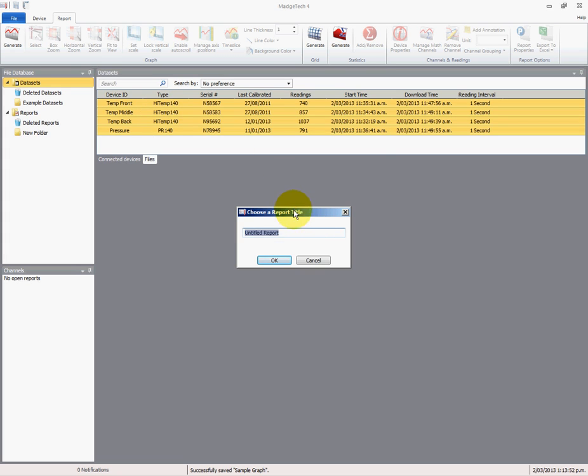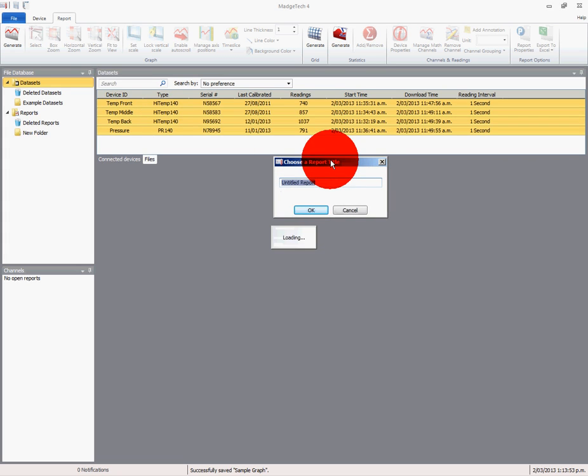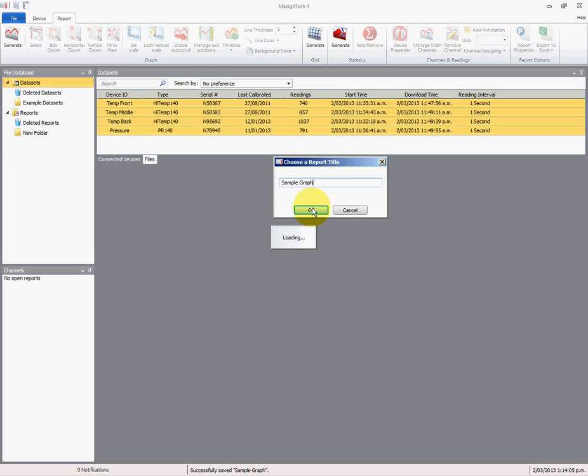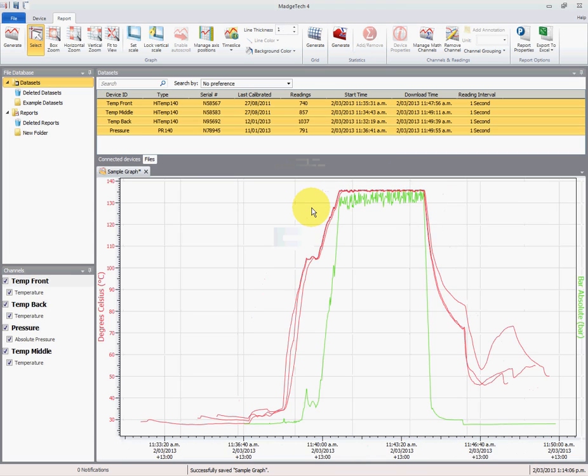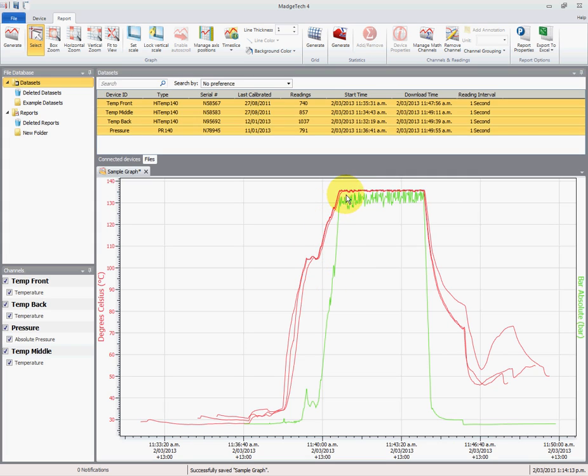I've got it set so that it prompts me to put a report title every time I open a report. This is a setting I'll show you later on. So I'll just call it sample graph and select OK, and it's going to bring it in. I've got some defaults set up that when it brings the temperature channel in, the color is red, and when we bring a pressure channel in, the color is green.